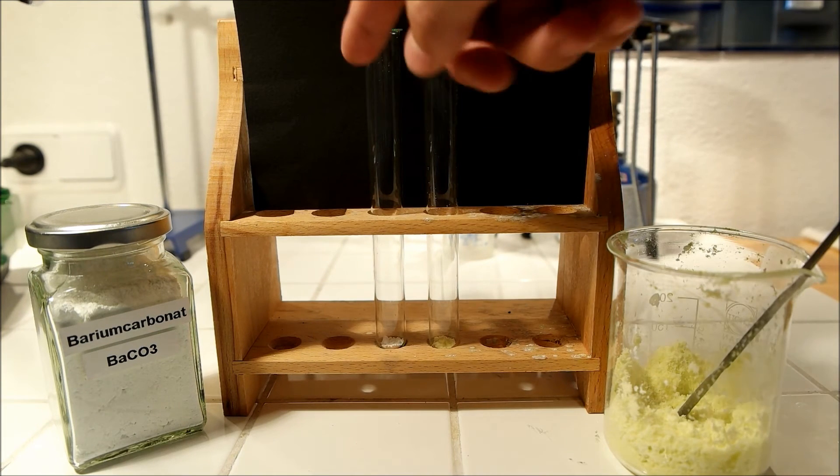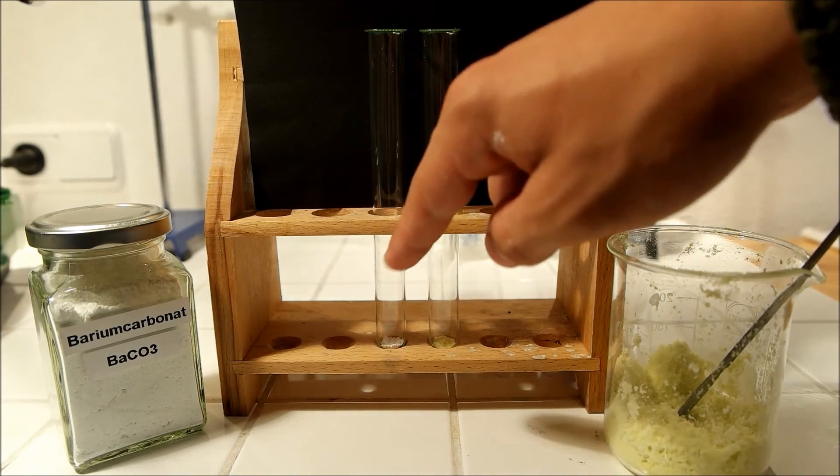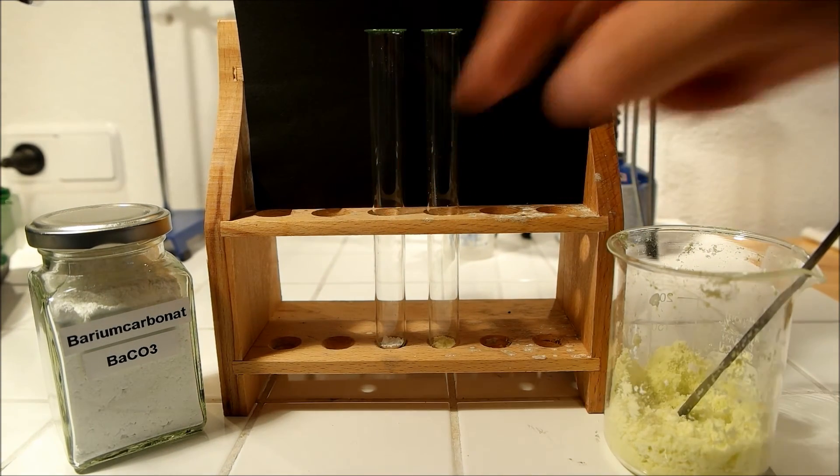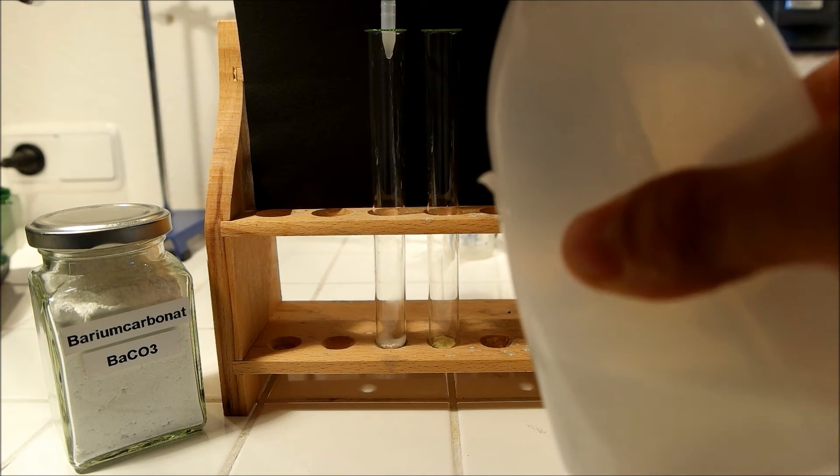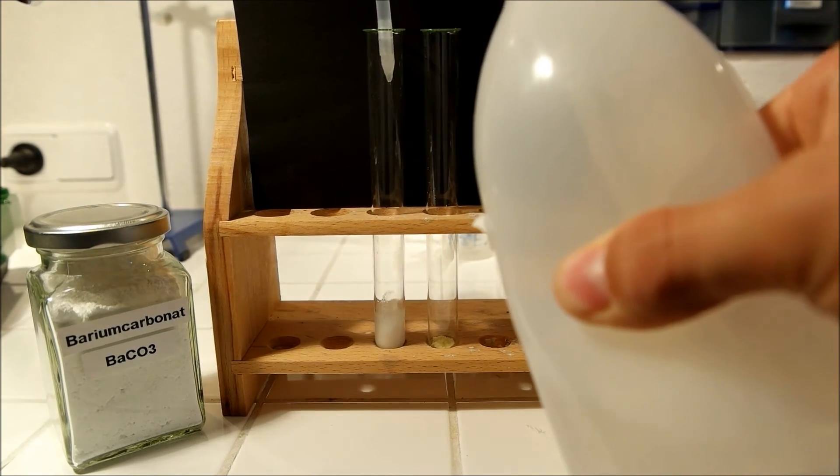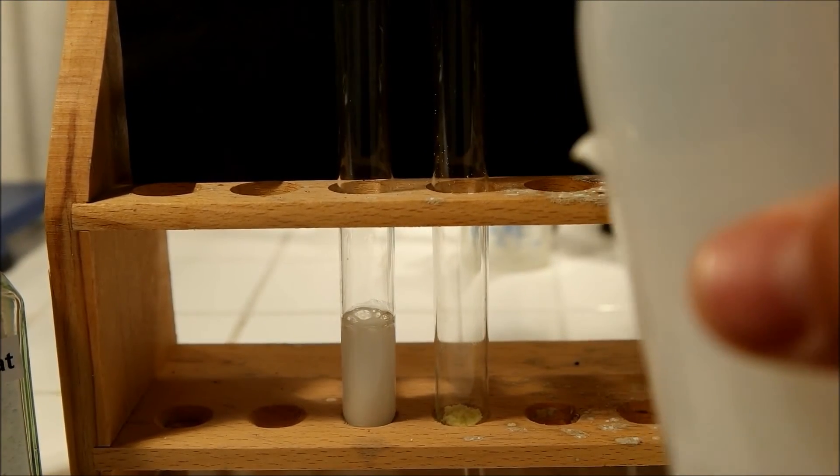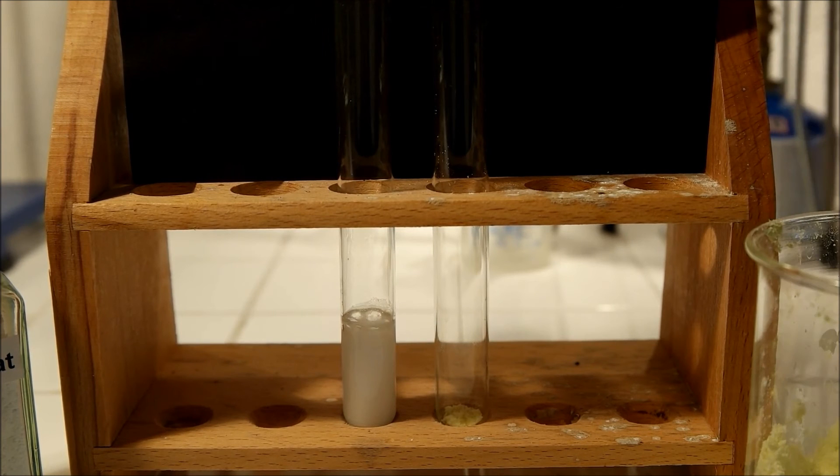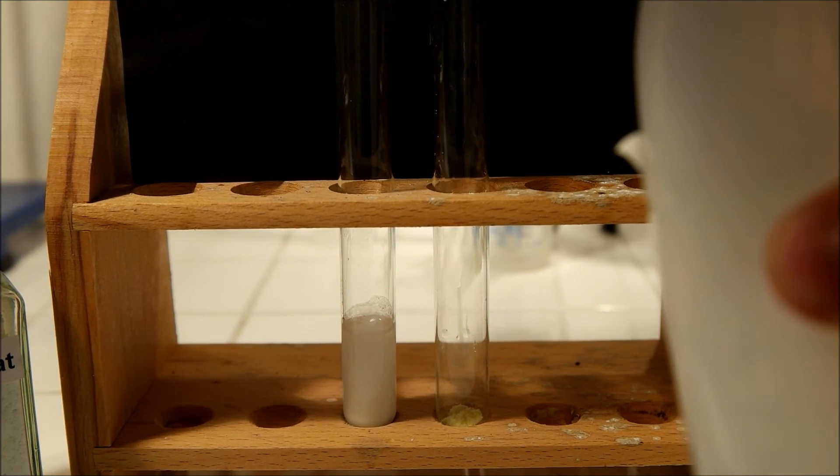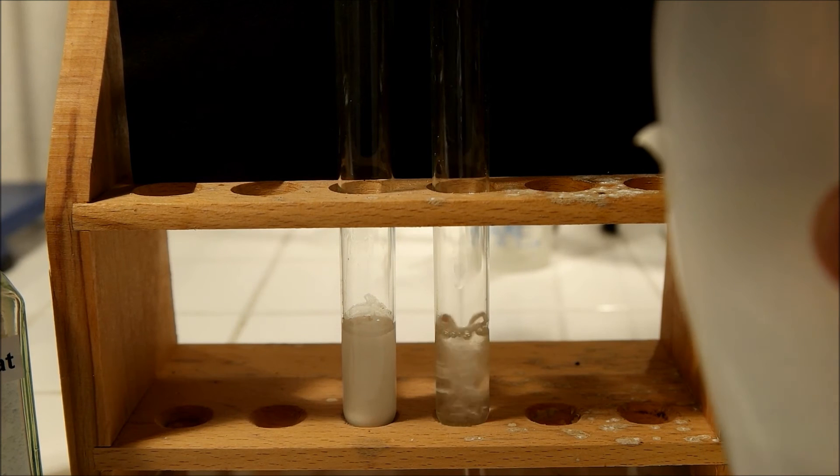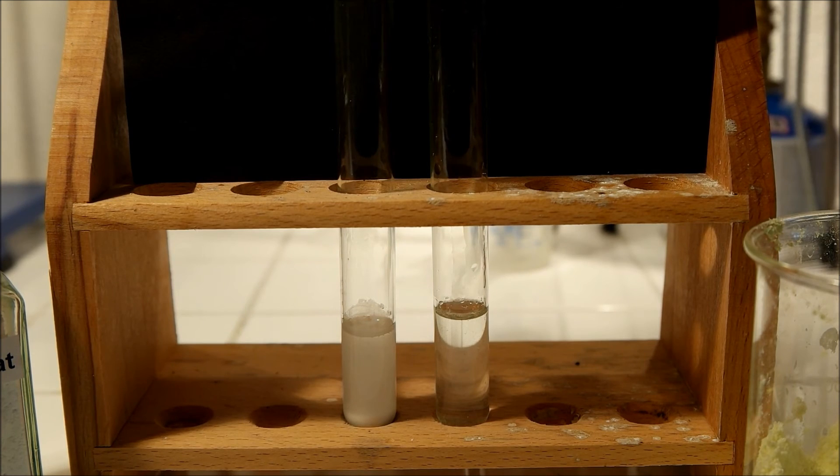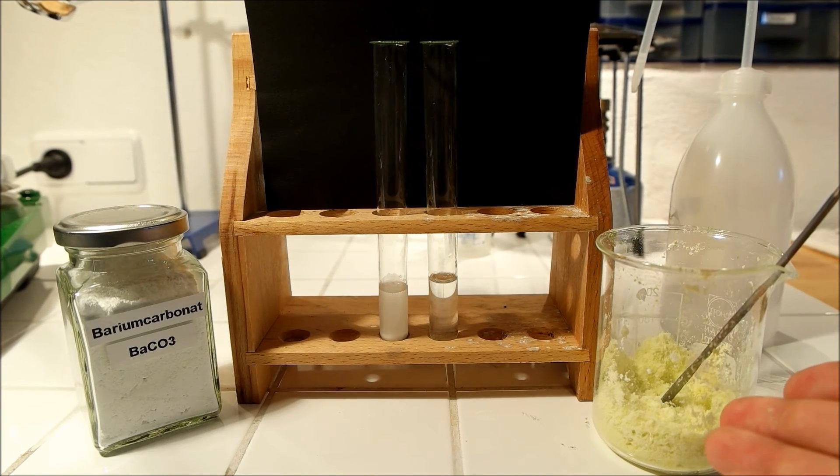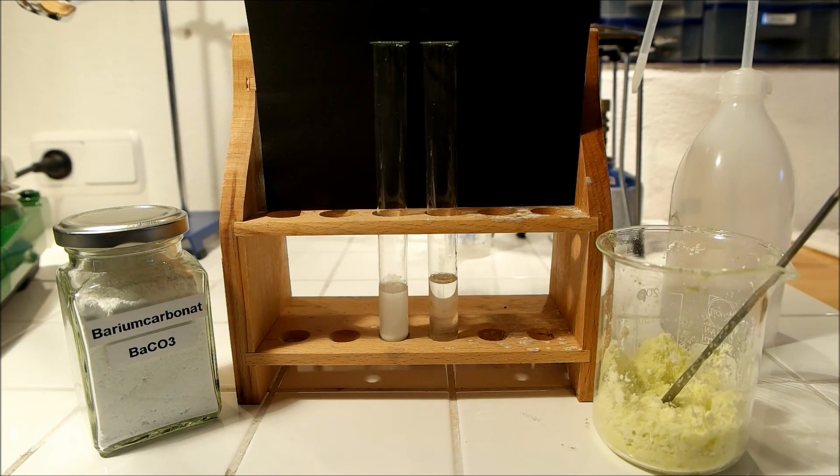In this test tube there's a small amount of barium carbonate. In here there's the same amount of barium chloride. Now let's see what happens if we add some water. Here you can see that the barium carbonate hardly dissolves, but the barium chloride dissolves very well. You can see that the whole thing is a very different salt. This has nearly nothing to do with our barium carbonate.